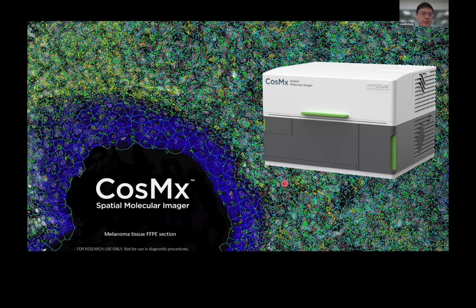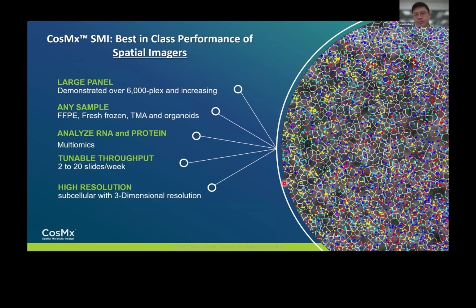Okay, so now we can move on to the next platform, which is called the CosMx Spatial Molecular Imager. Currently, this instrument is able to profile up to 6,000-plex for gene expression, and they are now also trying to increase the panel size. So by next year, they announced that they're going to come up with, I think, an 11,000 whole transcriptome atlas panel for users.